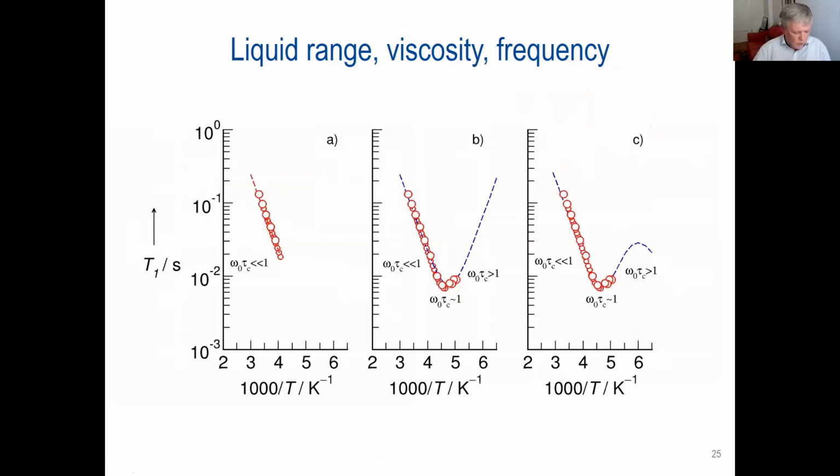Okay, so far we have the possibility by using this kind of methods to get a reliable coupling parameter. That's not only true for the deuteron quadrupole coupling constant, that's also true for bond distances as well, just for the case that we are in the extreme narrowing.